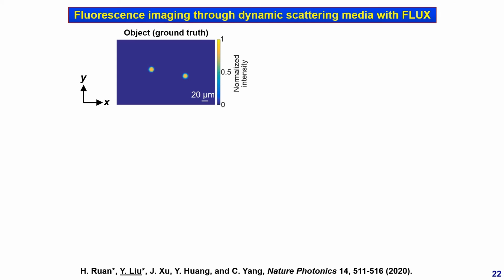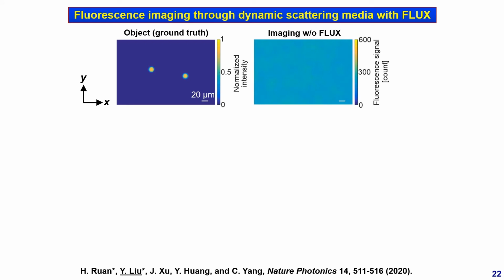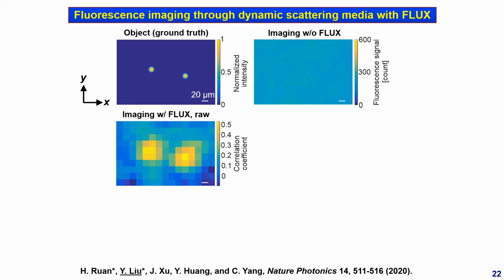When we put them inside the dynamic scattering medium, because of strong scattering, we cannot identify the beads under a conventional fluorescent microscope. However, with flux, we can image the beads inside the scattering medium.